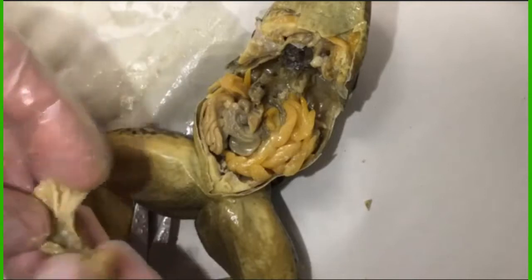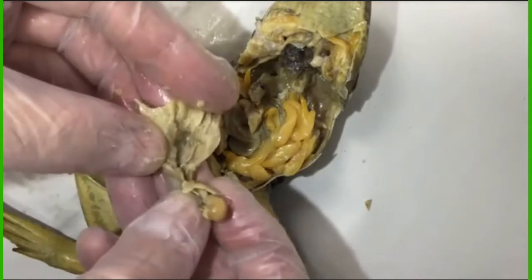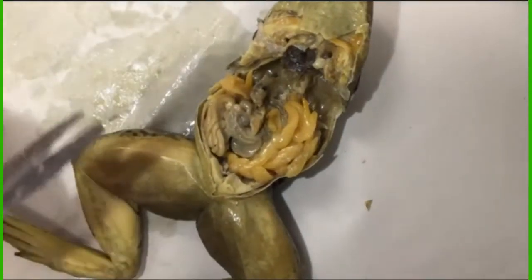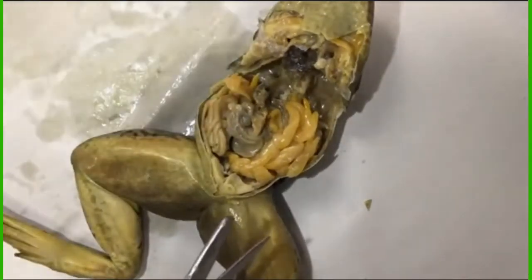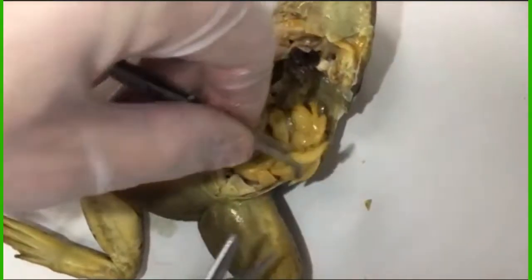And you can see that it's a very muscular, ridged organ for grinding up food. The frogs don't have teeth, so all that mechanical digestion goes on in the stomach, and that one was empty. No bugs or anything in there. I will show you some examples of some stomachs that had quite a bit of food in them.